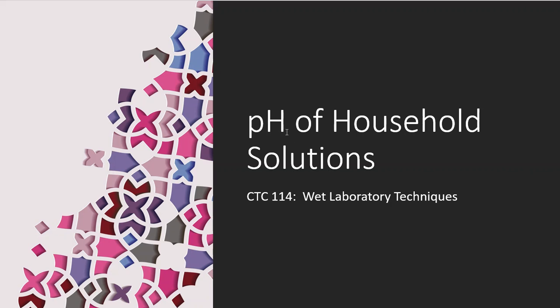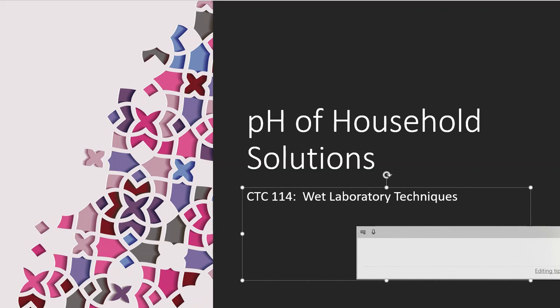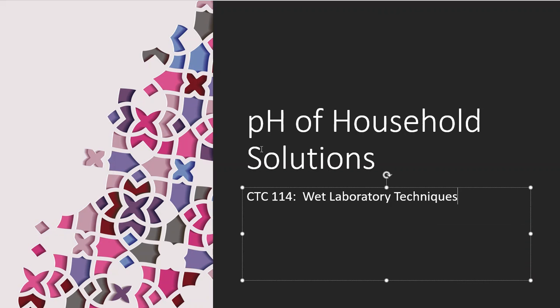So this particular lab is an intro to pH. It's an intro to how we measure pH, and we play around with a little bit of household solutions. I know it doesn't sound very exciting, folks, but that's just the way it is. This is the way that we get you into the lab and get you familiar with what's getting ready to go on. So, pH of household solutions. I about lost my voice there because I was so excited talking to you about pH.